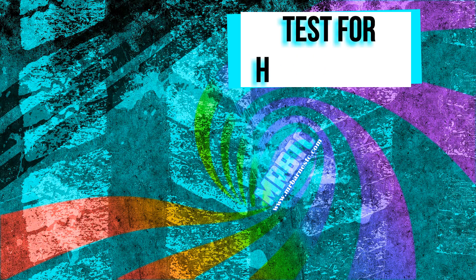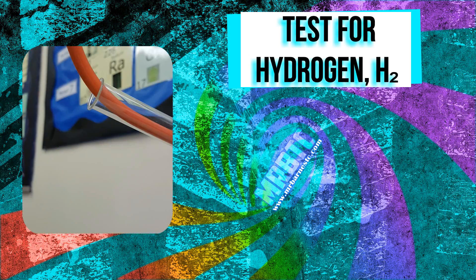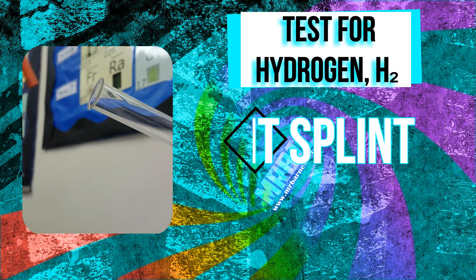Hi guys, welcome to this quick video looking at the chemical test for hydrogen. This test tube here is full of hydrogen gas, and what I'm going to do is put a lit splint into it.